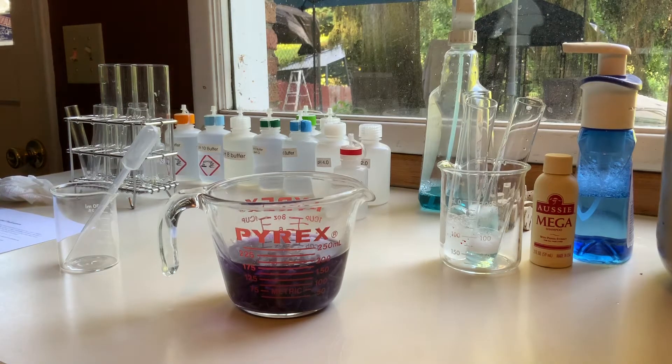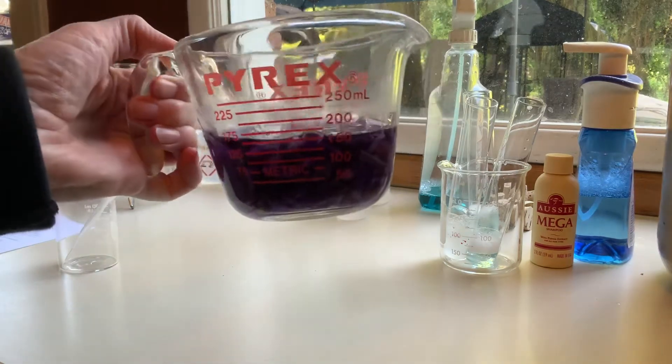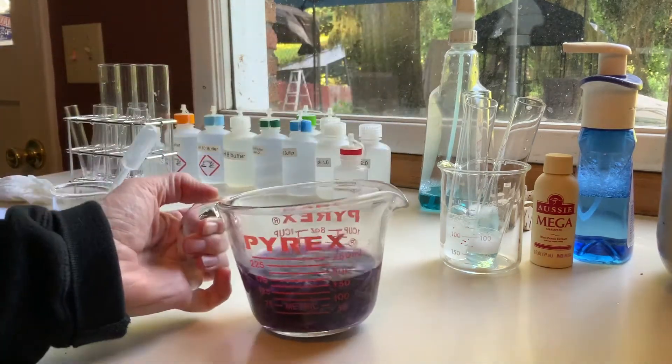I'm going to perform the pH buffers and indicators lab for Chemistry 121. I have chopped some cabbage here and heated it in the microwave. It's a nice dark purple color.